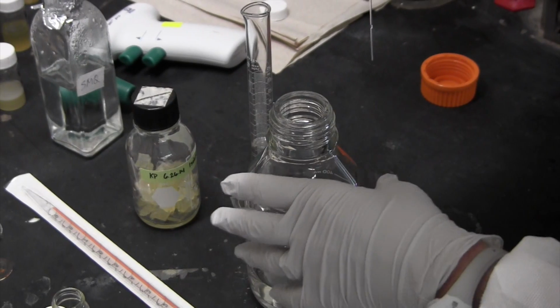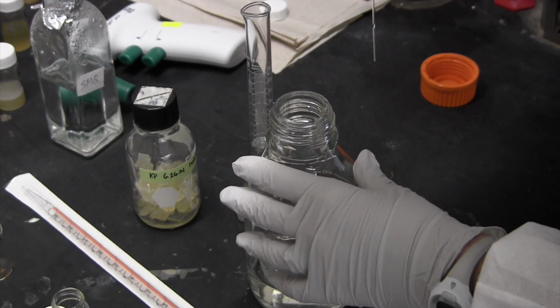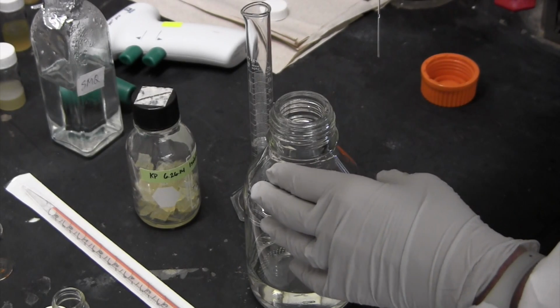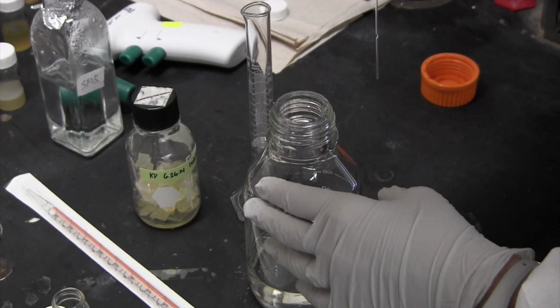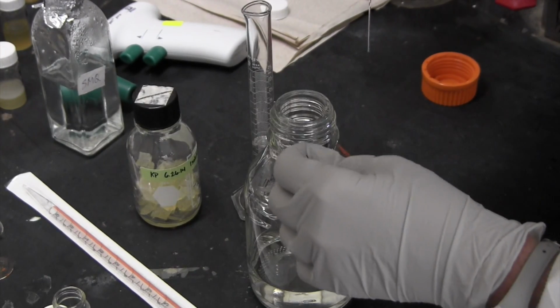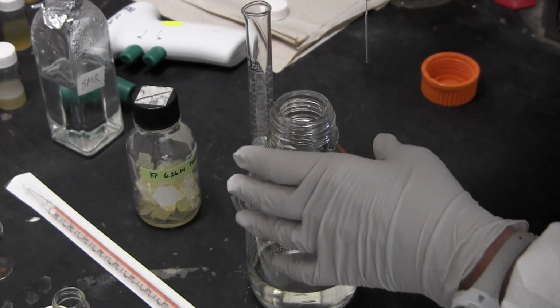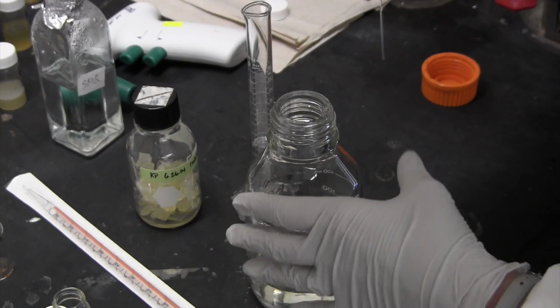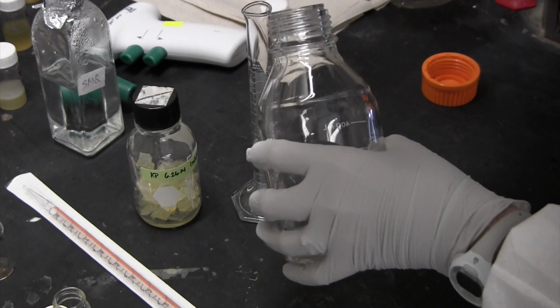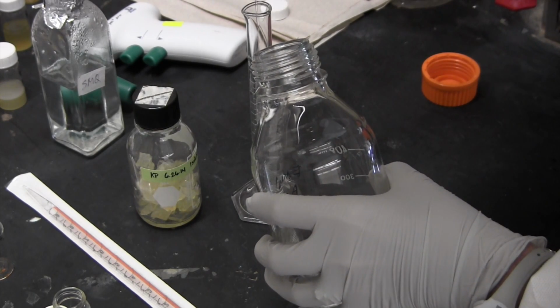So you should know that this is actually a rate limiting step in your lab, because you really don't want to have more than 1 to 2 students at a time, and most likely you or a TA should be distributing the ethyl acetate to the student and having them pour it into their agar. It definitely shouldn't be done unsupervised or outside of a chemical hood. So I'm just going to finish filling up my graduated cylinder here until we have about 12 mLs.